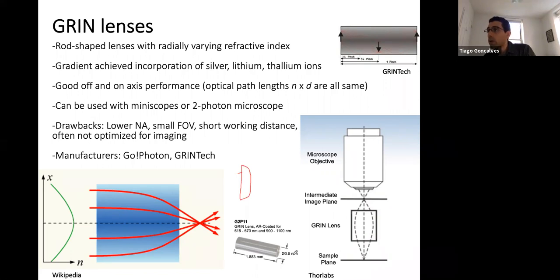If you ever lose one of these in the lab, it's hell, because you're going to be crawling through the linoleum just to find this, because these are really tiny things. And that's why they're great for using in the brain. The drawback is, of course, you have a small field of view, and wherever you implant it, you're stuck there. So also, GRIN lenses have a relatively, Claire.